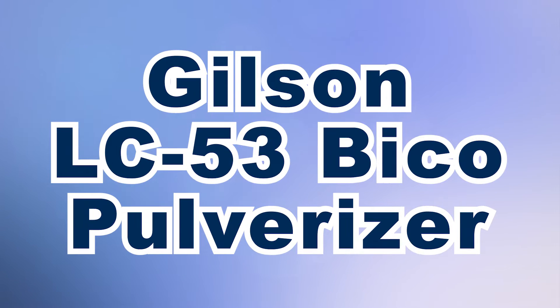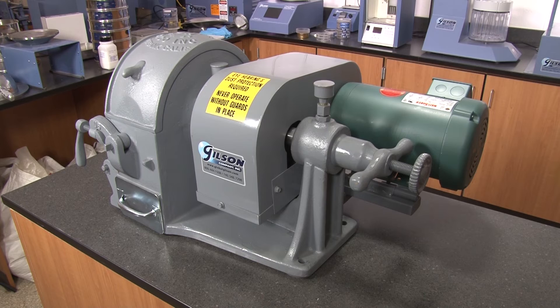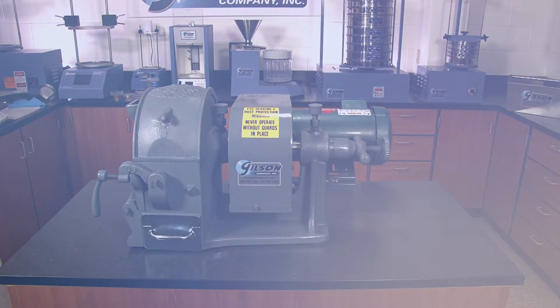The Gilson LC53 Bico Pulverizer features a time-proven grinding design for fast and efficient processing of a quarter-inch feed material, including hard rock and ores, into approximately 75 micron size, and all within a single pass.